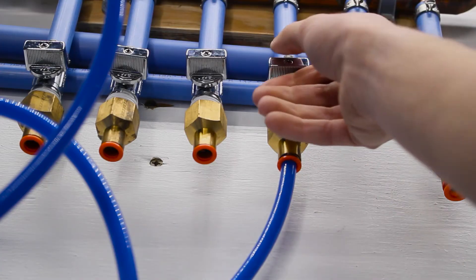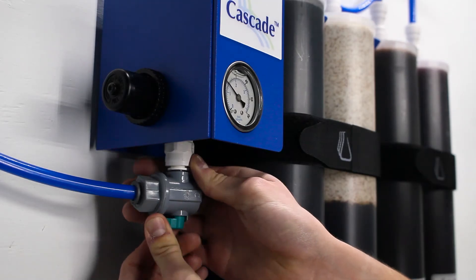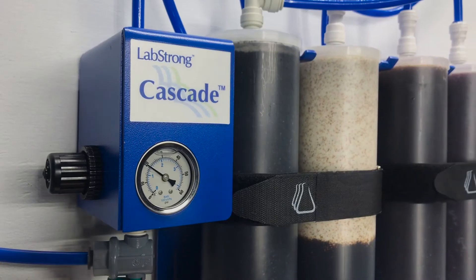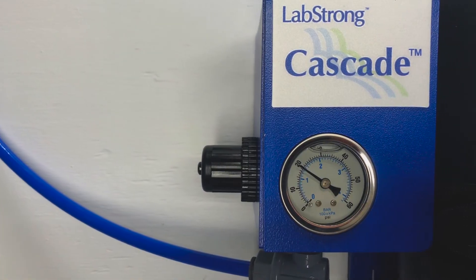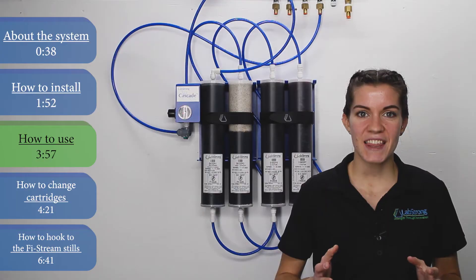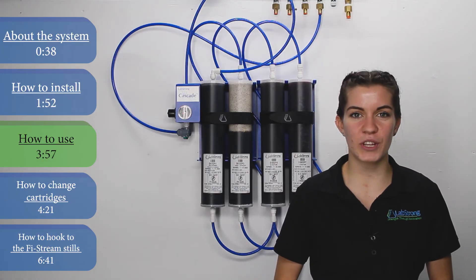To use the Cascade system, make sure your water source is turned on and your inlet valve is open. Then, when you open the outlet valve, you'll be dispensing pure Type 2 water. The pressure regulator regulates the pressure coming into the system at a constant 15 to 20 psi, and the pressure gauge gives you a reading of that amount. The system comes with the pressure regulator preset to the standard amount, so there's no need to adjust it.